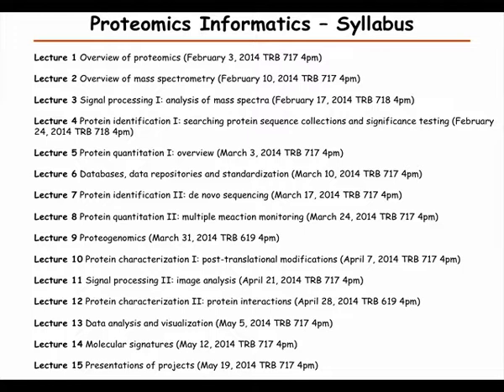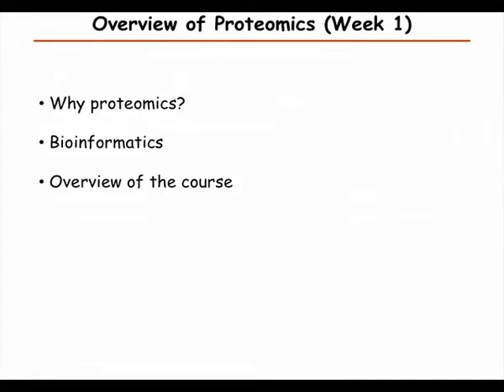We're going to get into quite a lot of detail on the mass spectrometry. This time I'll give a quick overview of the course. Today I'm going to give an overview of proteomics. You're probably already convinced that it's a good thing to work with proteomics, otherwise you wouldn't be here, but I'll give a few examples.